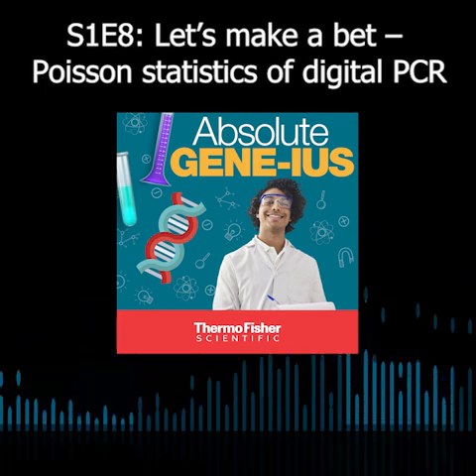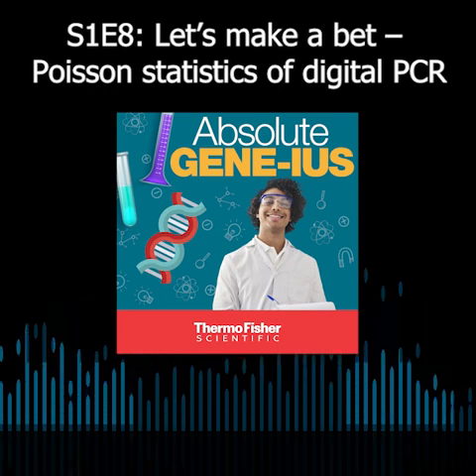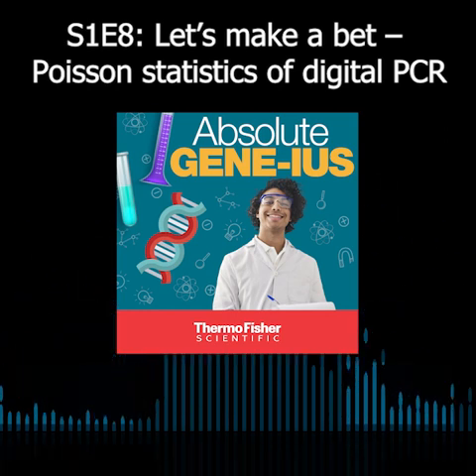Because if you're only expecting maybe a handful of molecules of your target present, a handful of positive chambers, you really want to know that all of them are really because of DNA versus because of something in the background.